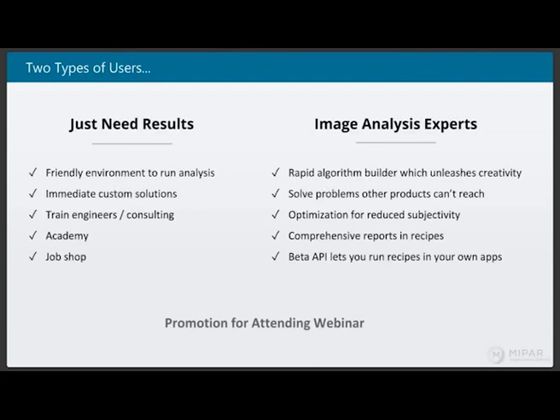I don't see Keyence immediately, but I know from experience that there have been other formats from different manufacturers that we didn't think we could open that we could. So it is very, very possible. Worst case, I'm sure that your acquisition software has the ability to export in some more generic formats to get the image into MIPAR.